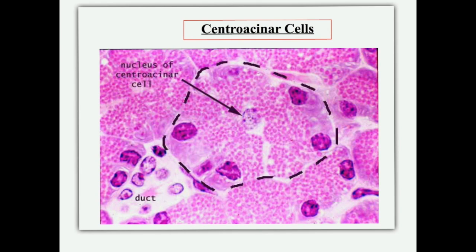This picture demonstrates the nucleus of the central acinar cell, which is the start of the intercalated duct. Because the duct is invaginated or telescoped inside the pancreatic acinus, you can see in the lumen the central acinar cell. These are the typical pyramidal cells with secretory acidophilic zymogen granules at the apex, the basal part tends to be basophilic, and the nucleus is rounded and basal in position.